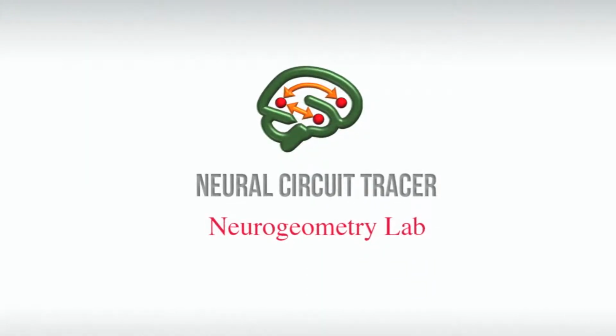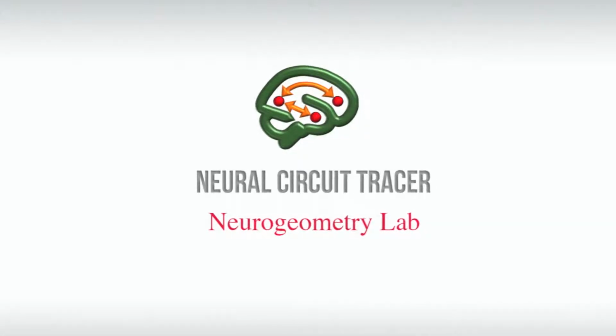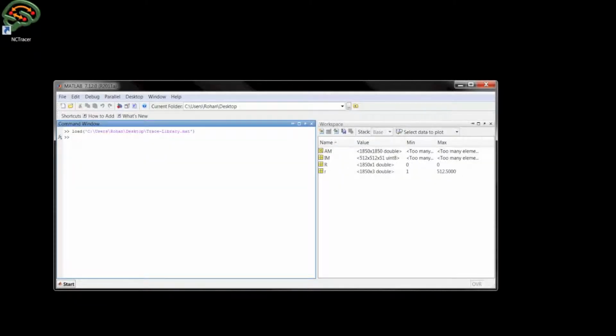NCTracer enables users to create and add custom Java and MATLAB plugins for image processing as well as trace editing and analysis. In this video, I will show you how to create a function in MATLAB and build it as a Java package that can be added as a plugin to NCTracer.